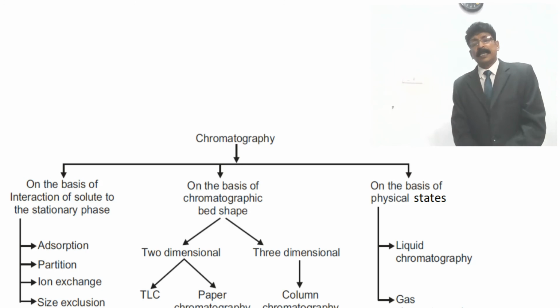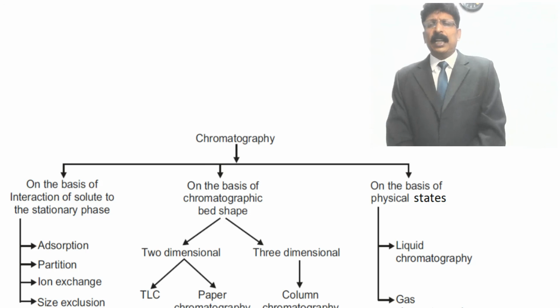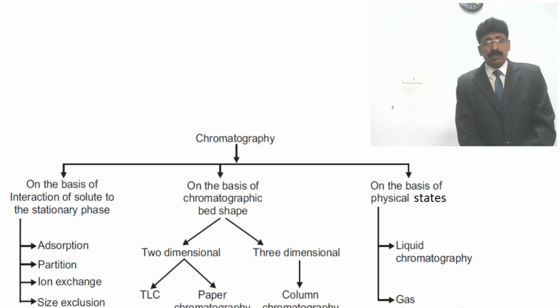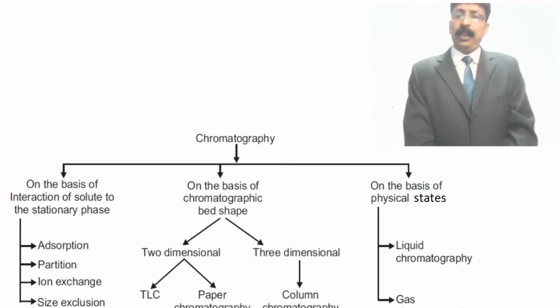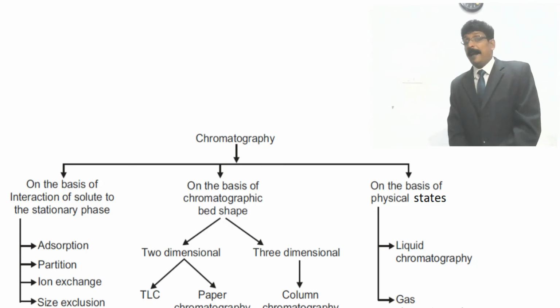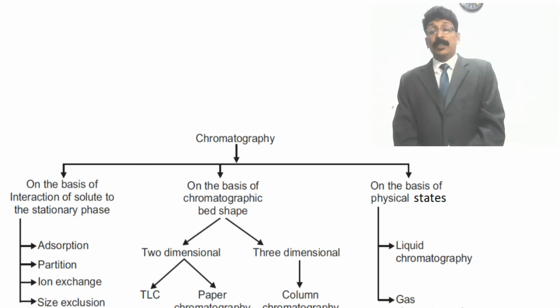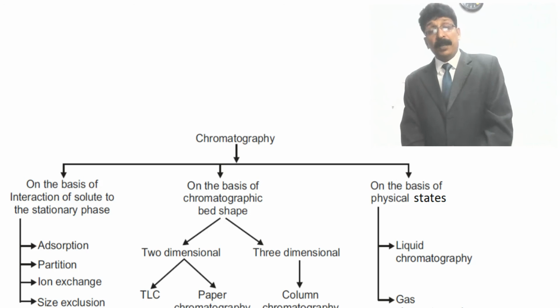When the stationary phase is solid and the liquid is the mobile phase, then it works under adsorption chromatography. When the stationary phase is liquid and the mobile phase is also liquid, then it works under partition chromatography. Gas has almost the same principle and physical properties as liquid, so gas-liquid chromatography also works on the partition basis of separation.